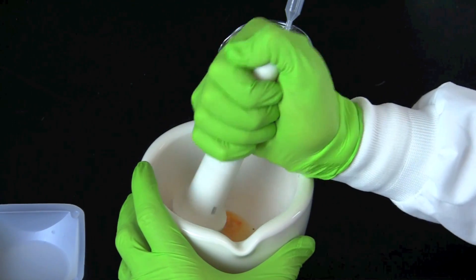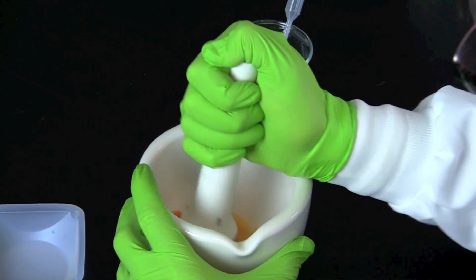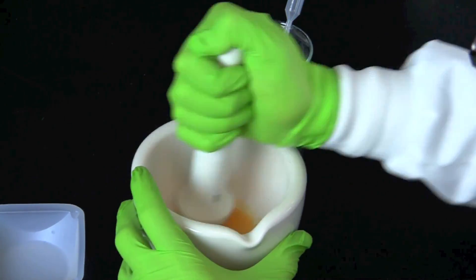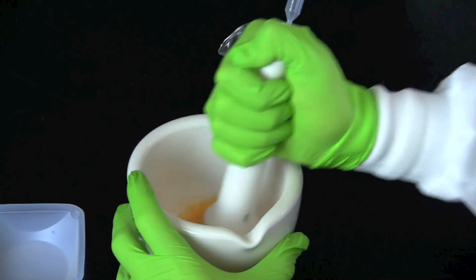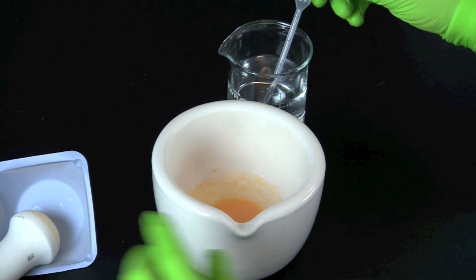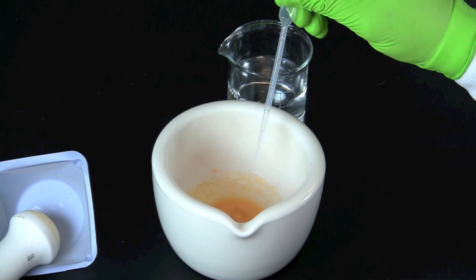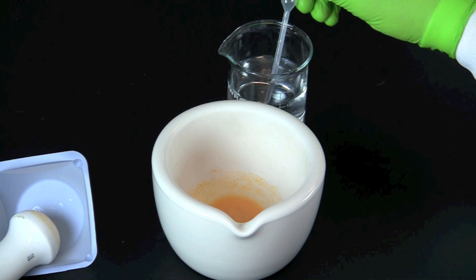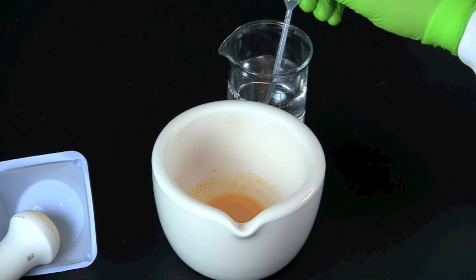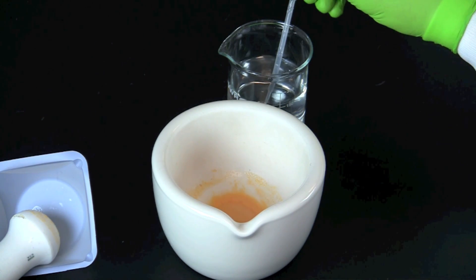Grind the food with the pestle for at least 2 minutes to form a slurry. Add another 5 milliliters of distilled water for every gram of food. Mix and grind further with the pestle until the slurry is smooth enough to pipette. Add another 5 milliliters of distilled water for every gram of food.